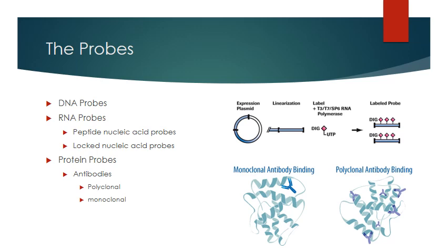If you produce a DNA probe, those are actually pretty stable. You can create those probes and they can be stored for some time in your laboratory. Many of these laboratories have to produce their own, or they do produce their own. As you know, some laboratories have in-house tests, so the probes can be produced on their own. The length of the probe will determine the specificity of the probe. Okay, the longer the probe is, the more specific it will be, because any short sequence could occur randomly in anything.